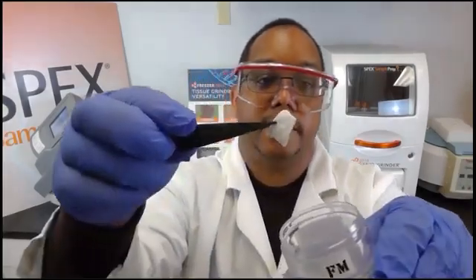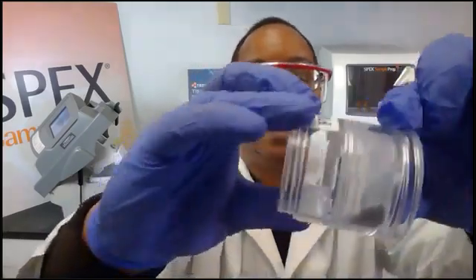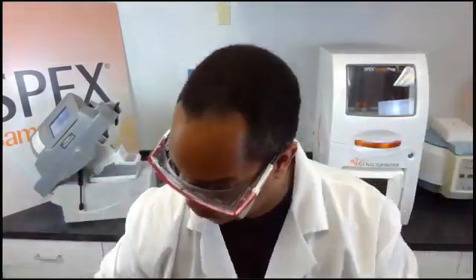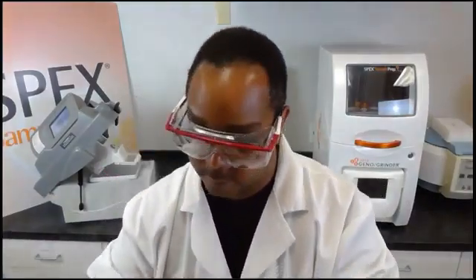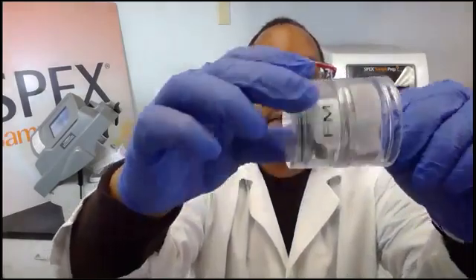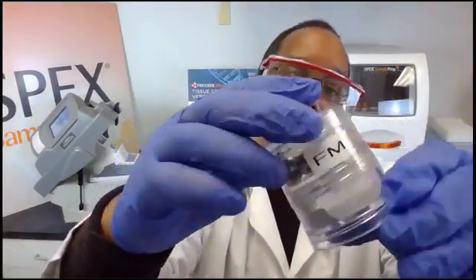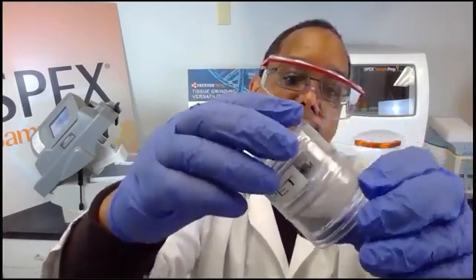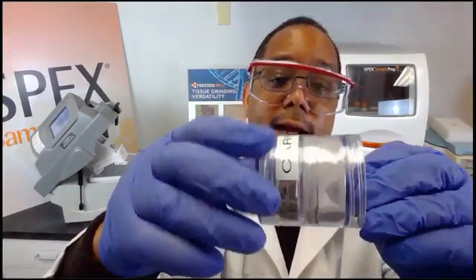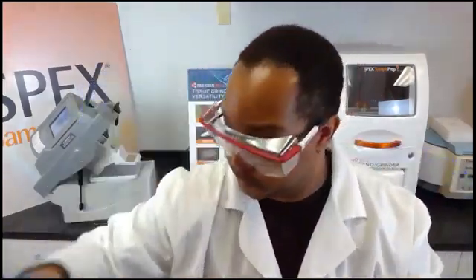We have textile fabric, where you can see the sample has been turned into a powder form. We also have carpet, where you can see the carpet sample has been turned into a powder form. This particular technique is used mainly for forensics, but it also can be used to analyze any type of hazardous materials that may be in the carpet.